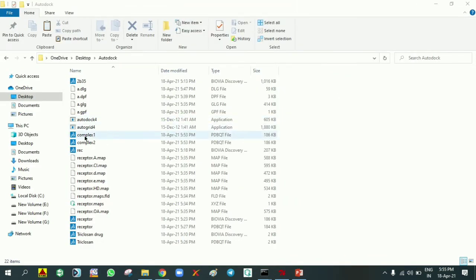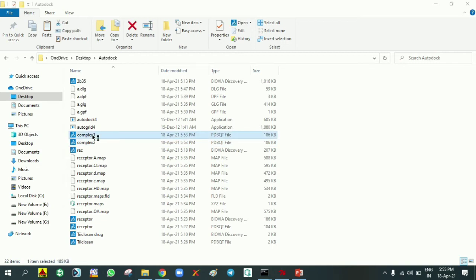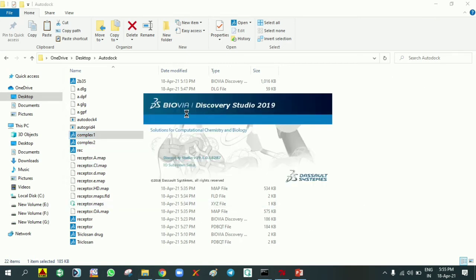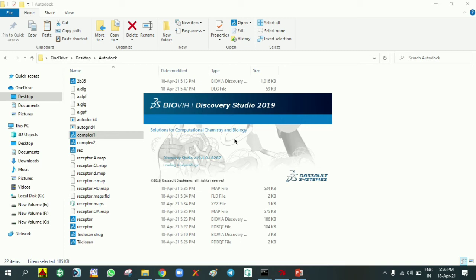In that folder what I created, complex 1 and complex 2, conformation 1 and conformation 2. I'm just clicking complex 1, so it is going to open in Discovery Studio as I installed in my system. It will open the BIOVIA Discovery Studio. It is a solution for computational chemistry and biology. The version is 19, 2019.